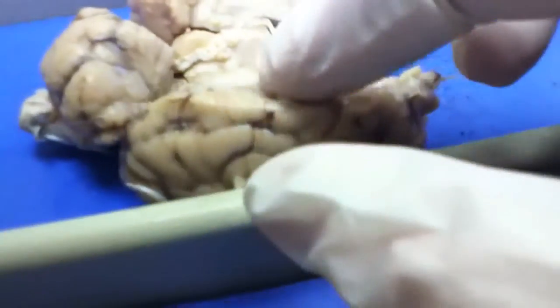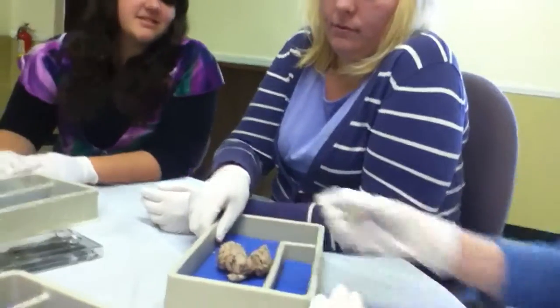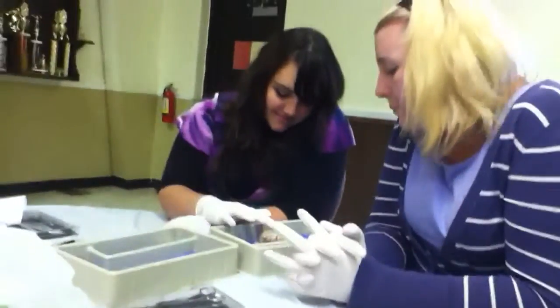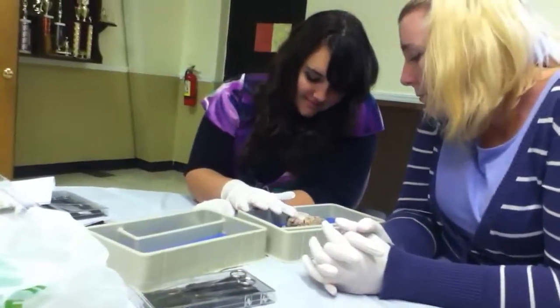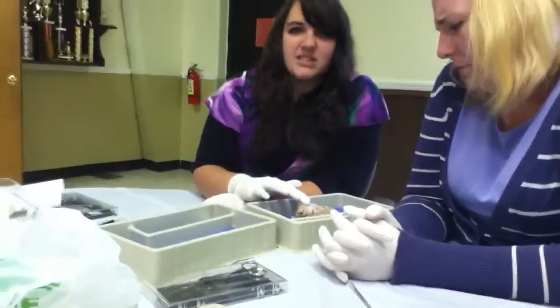See the corpus callosum? The corpus callosum, of course, connects both sides of the brain together. It almost smells like a pumpkin. I grew up around the farm — what can I say? It does smell like a pumpkin.